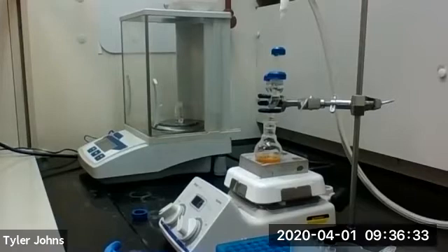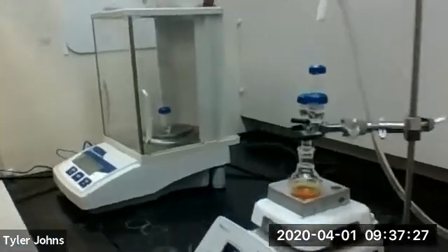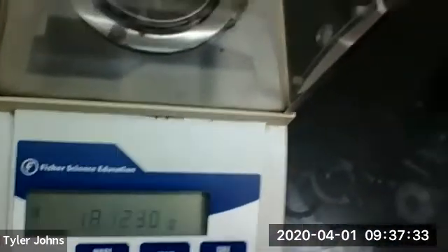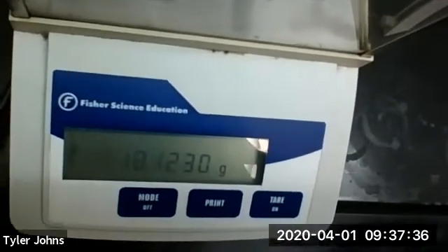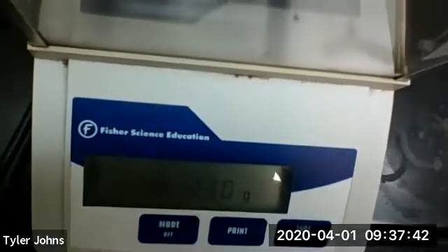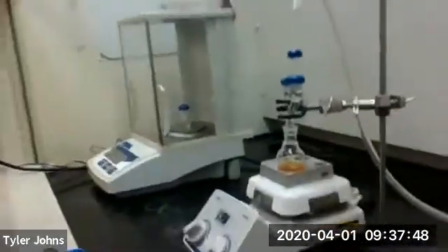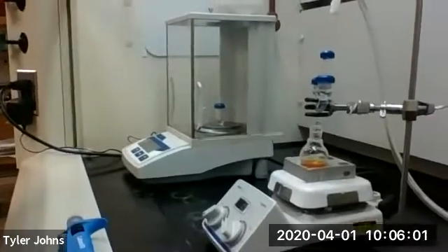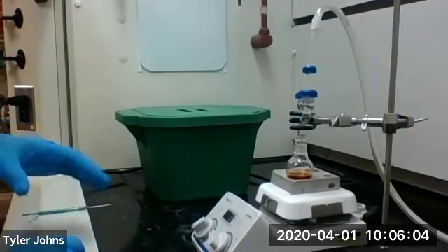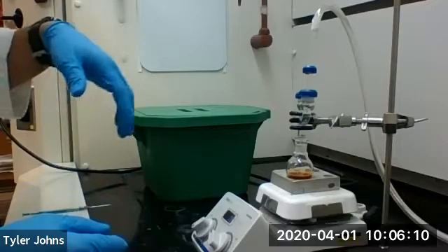We're going to let our reaction mixture stir for 30 minutes. Note: I had previously forgotten to weigh the vial with the cap, so use the weight of the vial with the cap to determine how much toluene was added. At this point our reaction has been stirring for 30 minutes, so we can now remove the gas trap from the Claisen adapter.